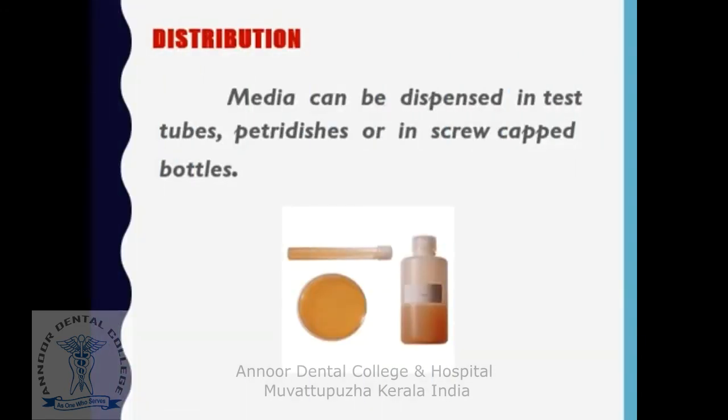About the distribution of culture media, media can be dispensed in test tubes, petri dish, or in screw-capped bottles. So either petri plate or test tubes or in screw-capped bottle, media can be taken.